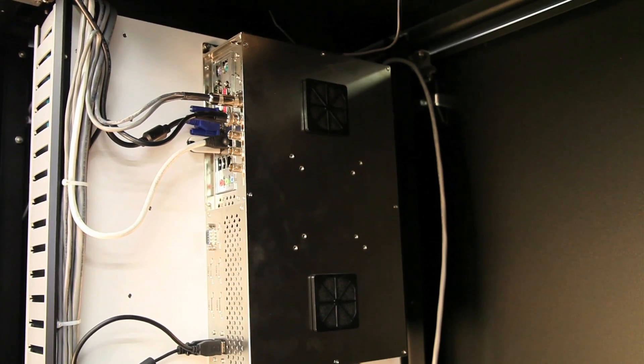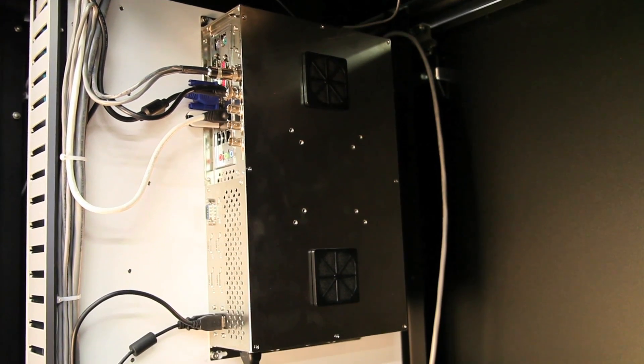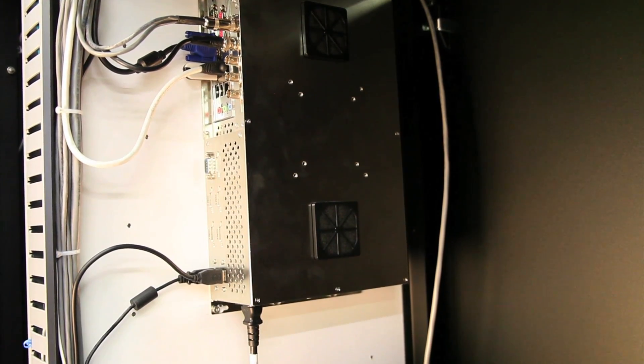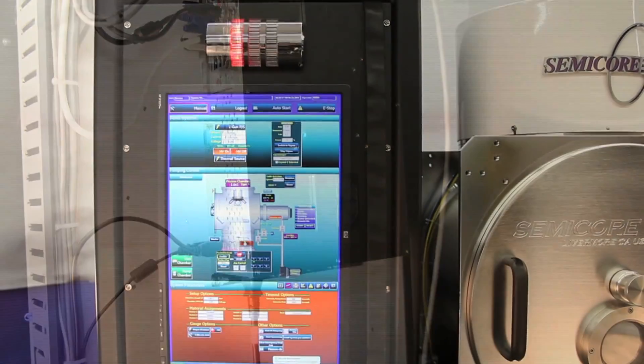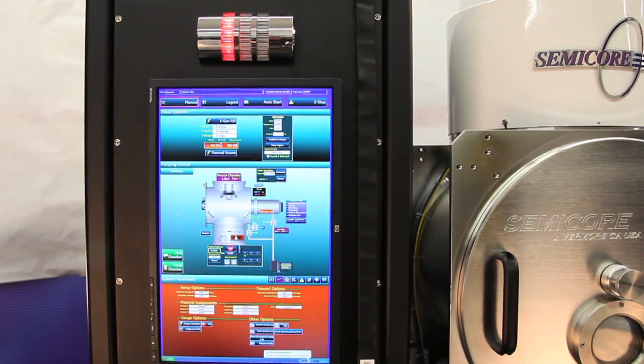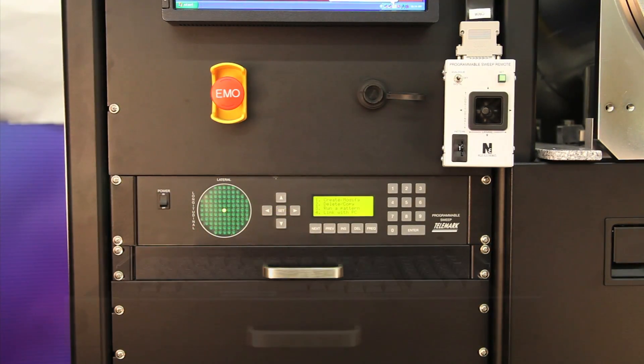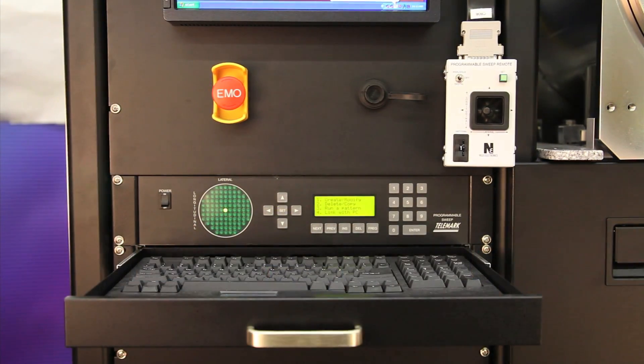The system features automated vacuum controls through its industrial-grade computer, as well as automated recipe control of the deposition process through its included rate controller.